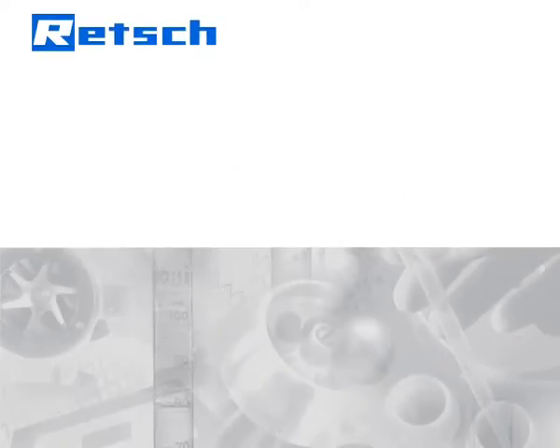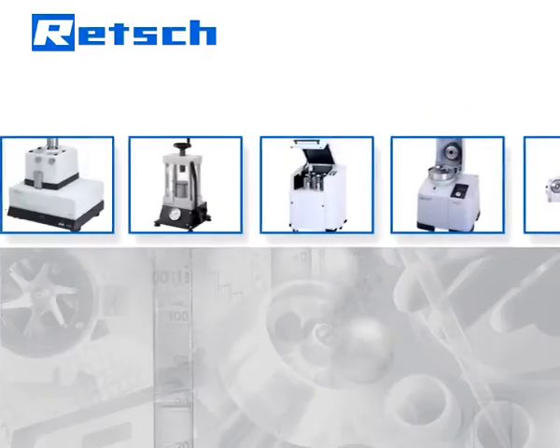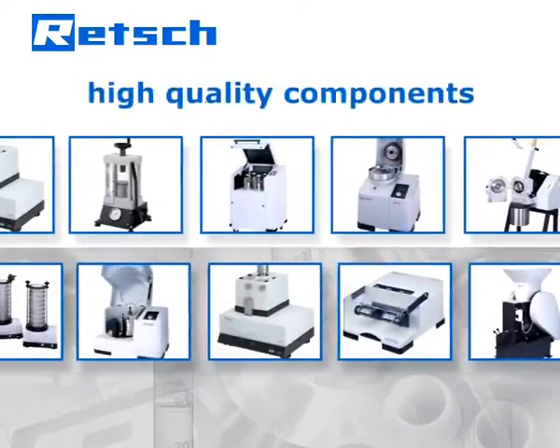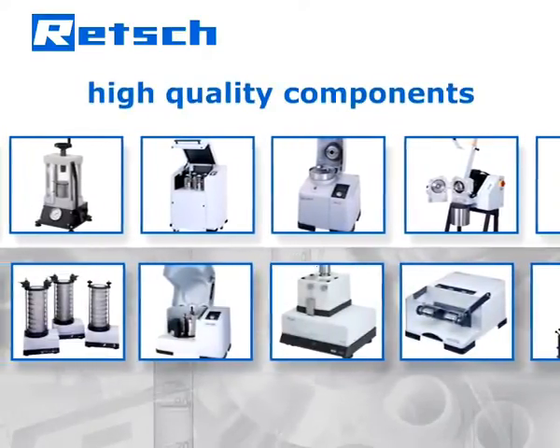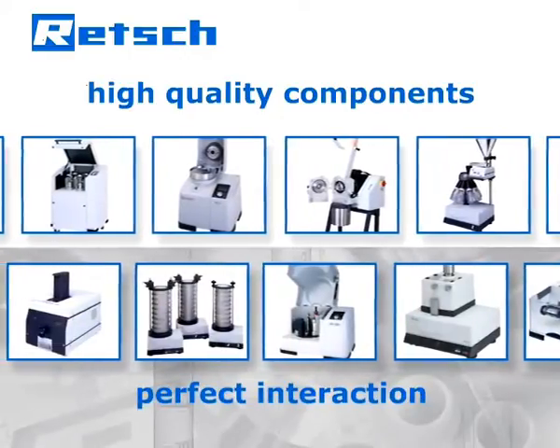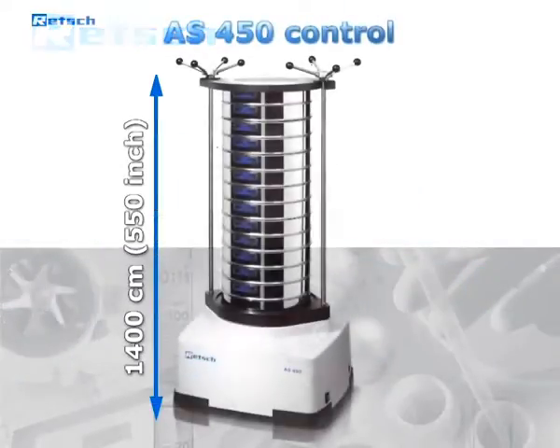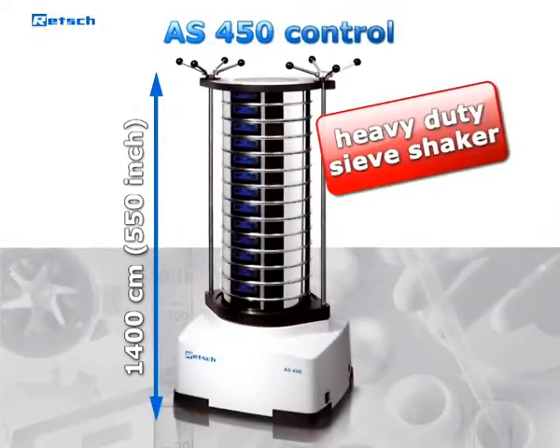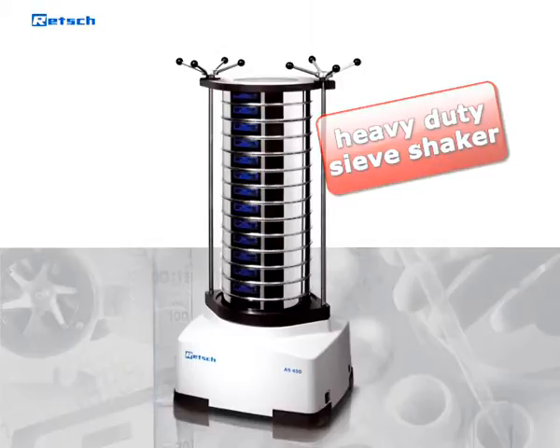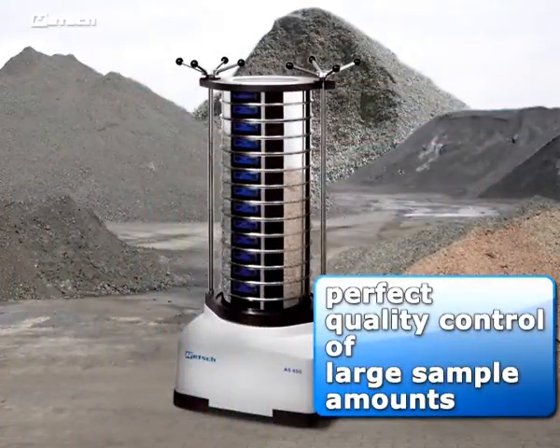Rech's product philosophy is based on a quote by Aristotle: the whole is greater than the sum of its parts. Therefore, our R&D department does not simply choose high-quality components, but also pays full attention to their perfect interaction. It is this approach which determines Rech's products to be superior and makes our heavy-duty sieve shaker, AS450 Control, the optimum solution for the perfect quality control of large sample amounts of bulk materials.